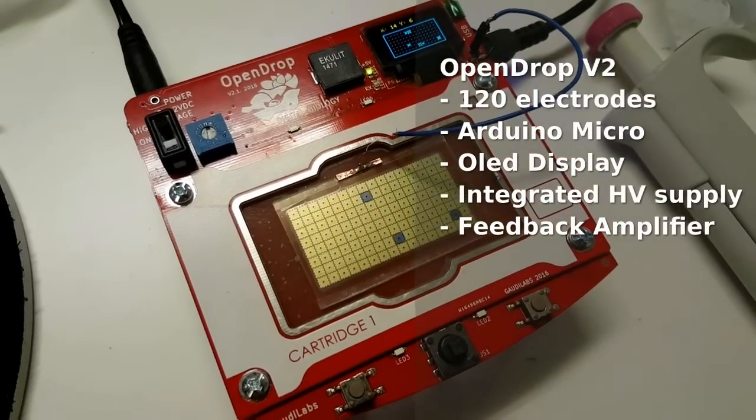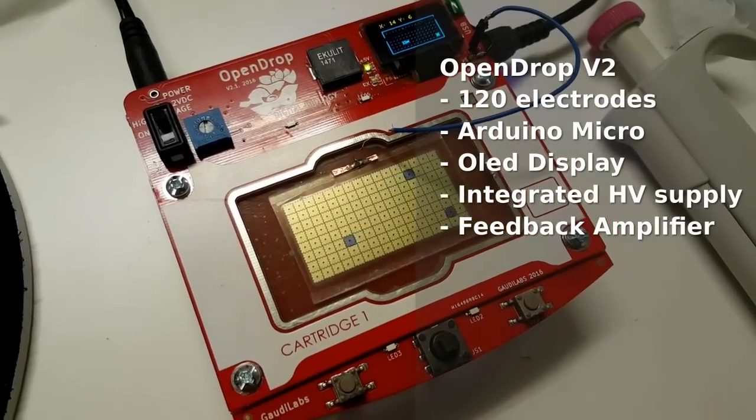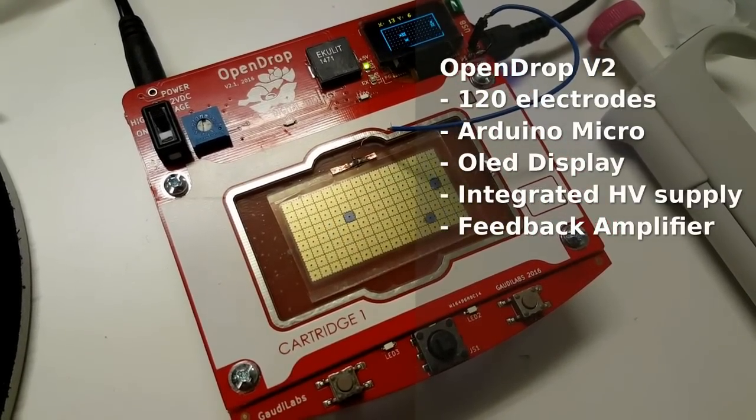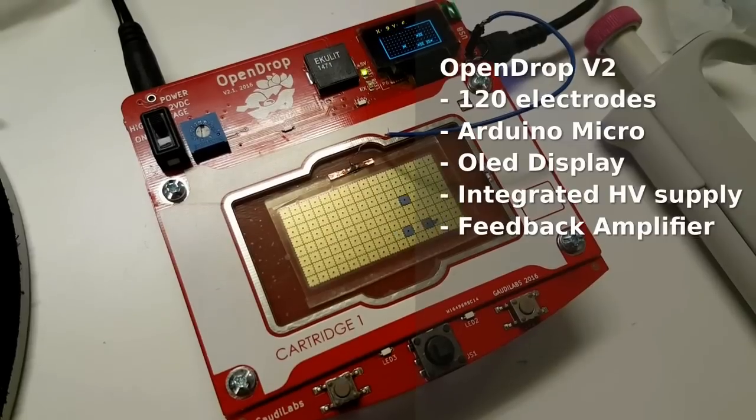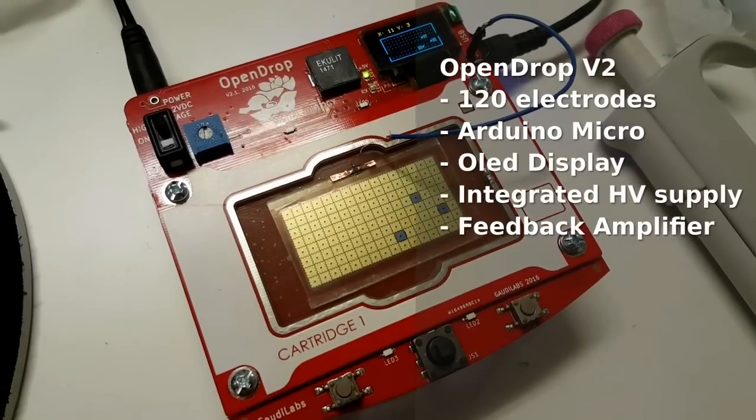The OpenDrop version 2 has 120 electrodes, is driven by Arduino Micro, has an OLED display, integrated high voltage supply, and now the working feedback amplifier.